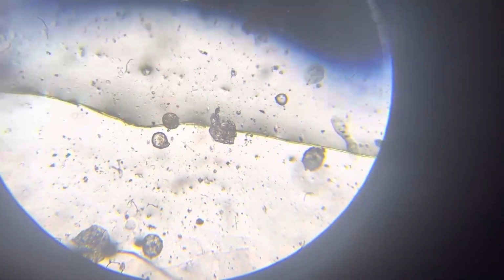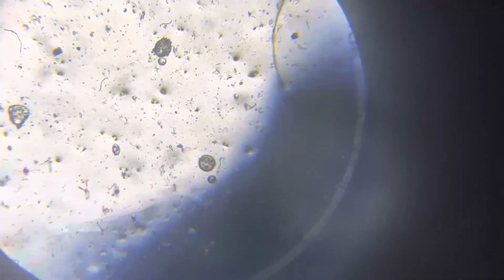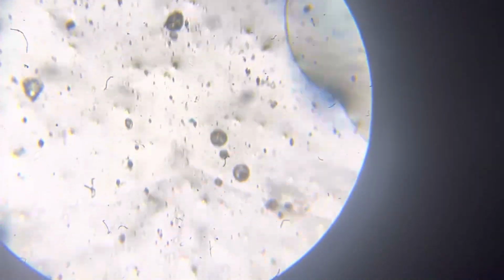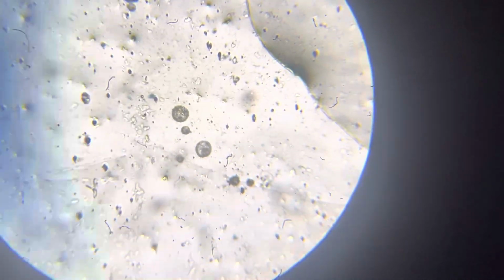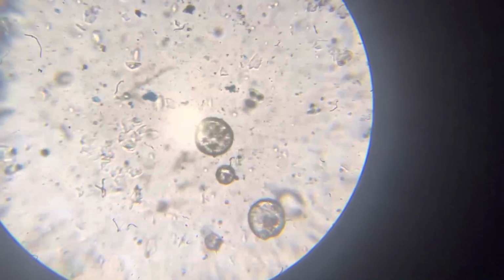Very nice. Just a second. These are baby ciliates? Are those ciliates? Do you remember what ciliates are? Maybe we will zoom in. Are these ciliates? I don't know. You tell me.